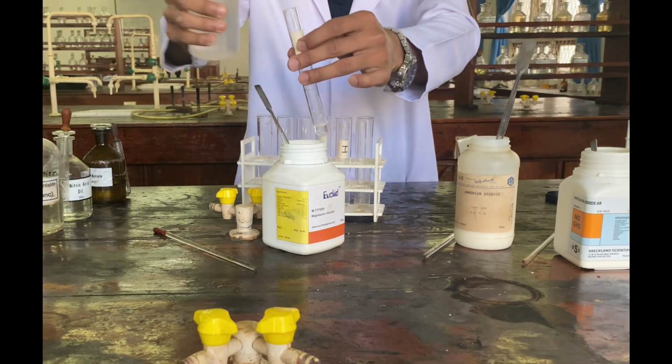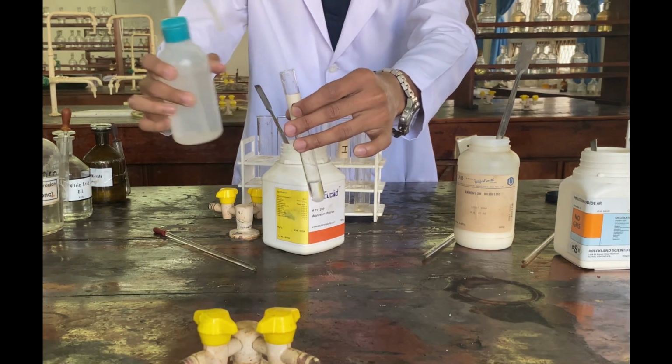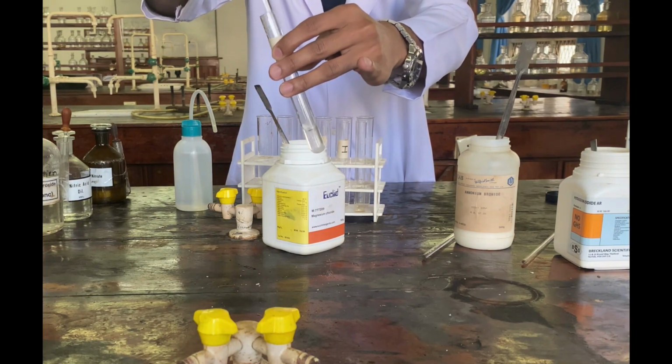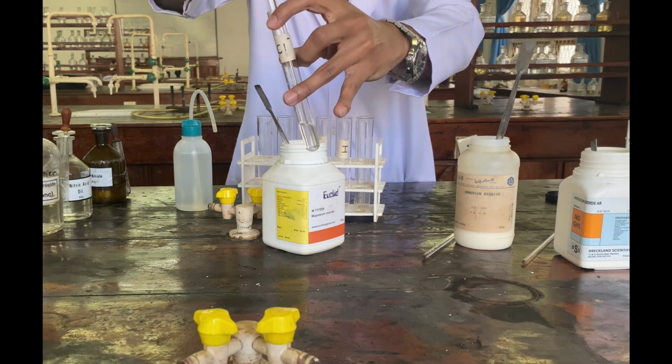Small amount of magnesium chloride into a test tube and add a little bit of distilled water and make aqueous solution of chloride ions.